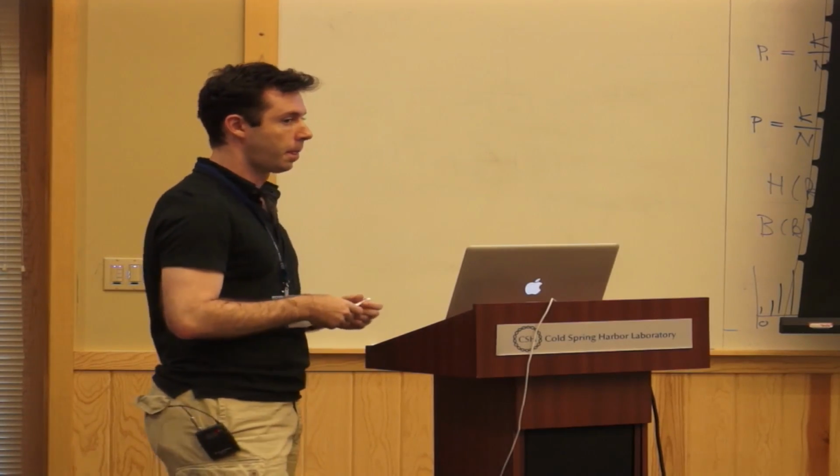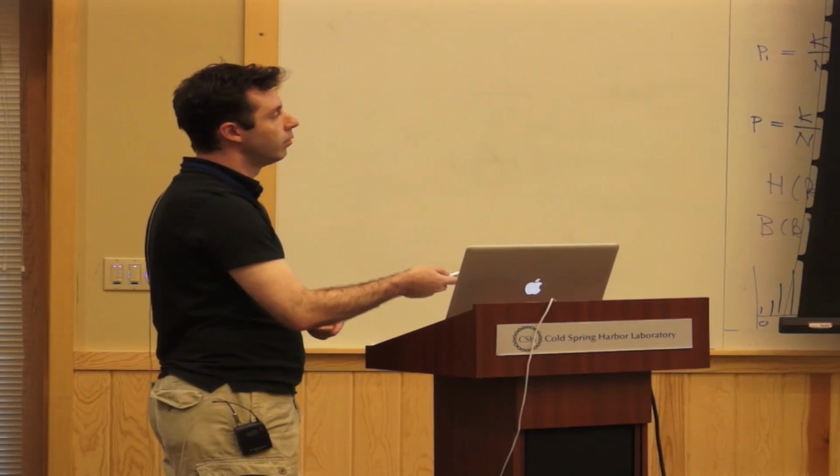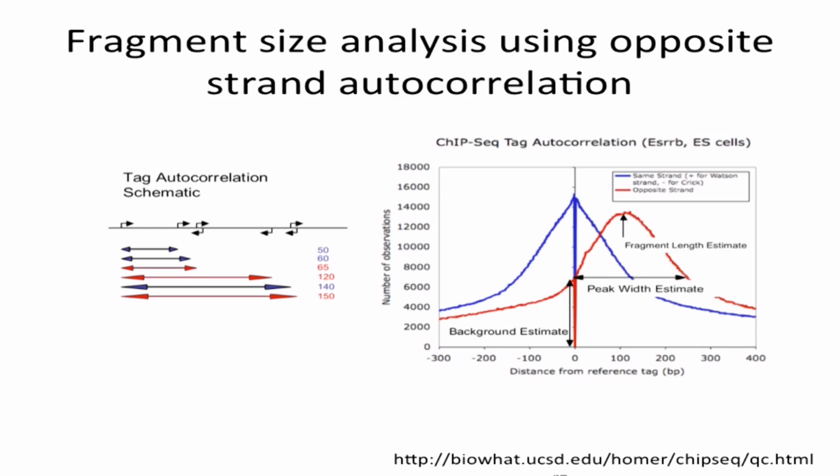That part I understand, but I'm confused why you would get this typical read length offset with the reverse strand, right? It's the other strand. You look at the other strand. So you look at blue. Oh, you mean in the same strand? But that other read could come from another IP fragment. Well, is this also due to the peakiness of the data set? I mean, this one I understand, but the next slide that you showed, with this one here.